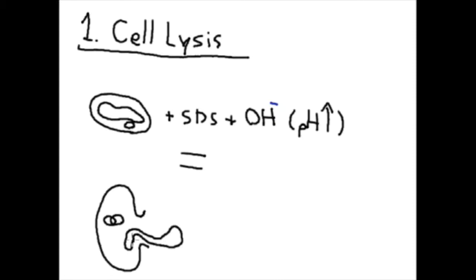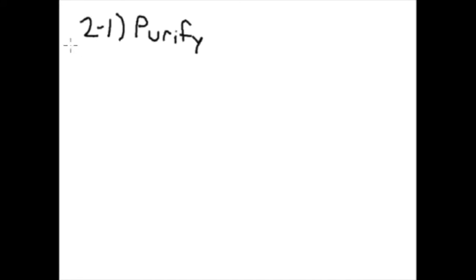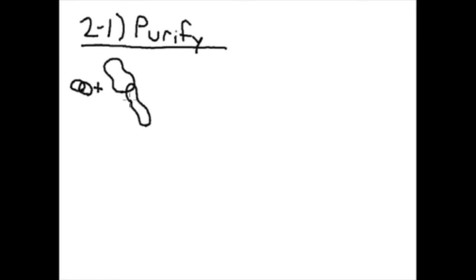An acid is used to rapidly drop the pH. Small DNA molecules, such as plasmid DNA, will reanneal and enter back into the solution, whereas large chromosomal DNA fragments will not successfully reanneal and form a precipitate. The precipitated material can be removed via centrifugation. At this point, large impurities, such as proteins, are removed.